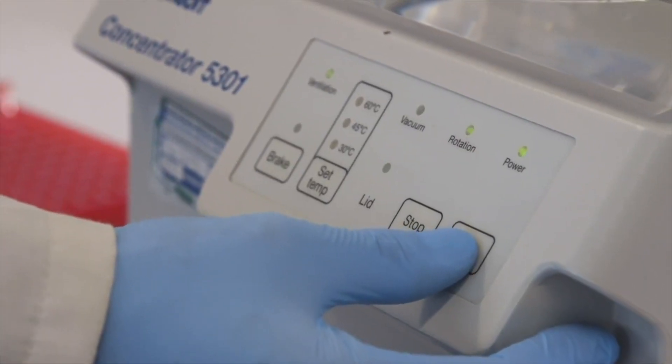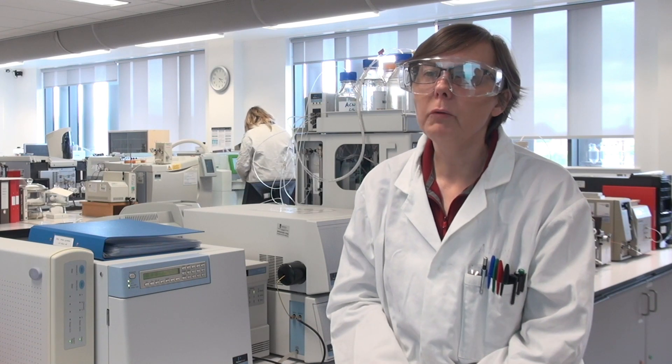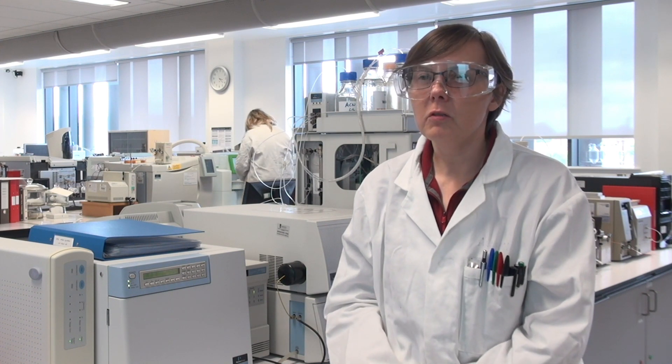By the time they come through to their third year, they can choose to do a project with an analytical chemistry component. In that case we give them some training and they become competent to use the instrument. They get signed off with a competency sign-off sheet and then they work more or less unsupervised, very independently on the instruments.